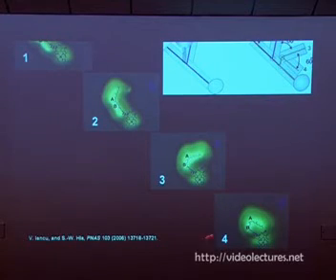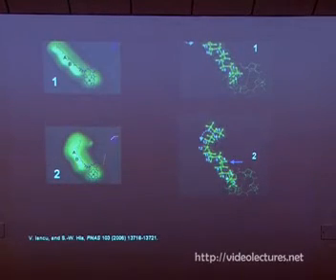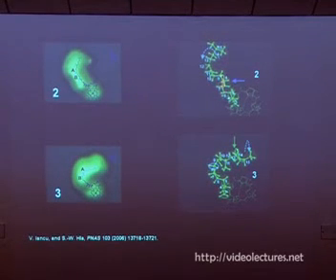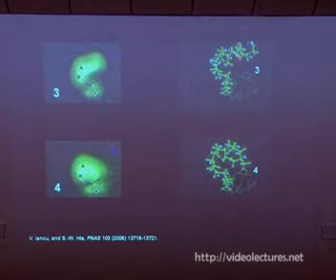Then what's happening here, we need to explain in more detail. When I explained that to the chemists, saying it involves 60-degree changes, they said it's not enough. We need to explain more. So we again ran the calculations. It turns out that if we want to change from A to B, if we inject the electrons and rotate only one single bond, the carbon atom 11-12 bond, keeping the rest of the tail rigid like a tree, you rotate it, you get this structure. And if we rotate only the single C7-C8 bond, keeping the rest rigid, in the counterclockwise direction, we get this structure. Similarly, if we rotate again this C12-C13 bond in the clockwise direction, we get this structure.